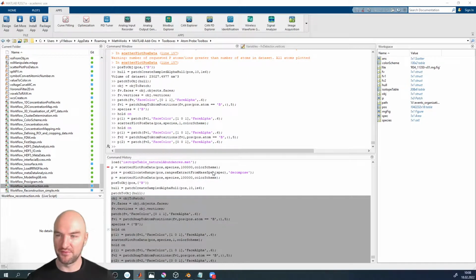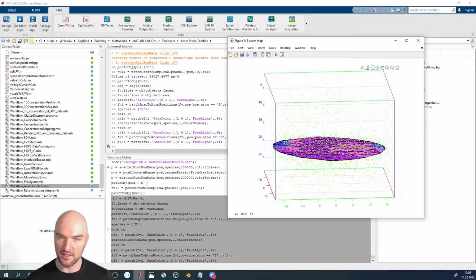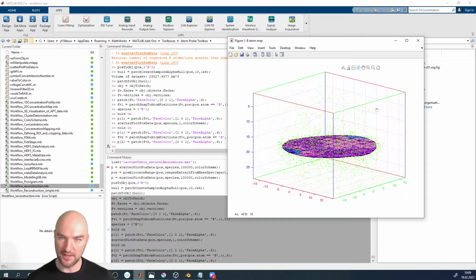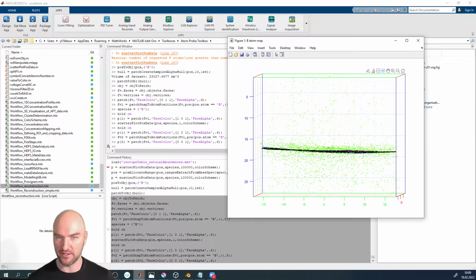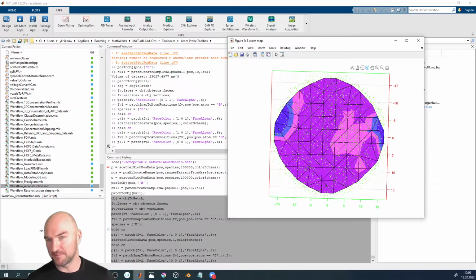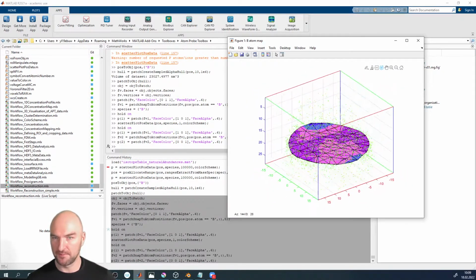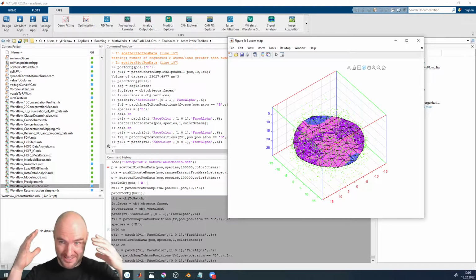And stop me if this is going too fast. Yeah? Okay, so we're pretty happy because we have a grain boundary model that sits on our grain boundary pretty okay. So we can run proxygram already, no problem. Interfacial excess calculation, no problem. But the question is now, does it really go all the way to the boundary? And the answer is, well, no, because we kind of made sure it doesn't go beyond the boundary, because that would be bad. But we wanted to go exactly to the boundary.